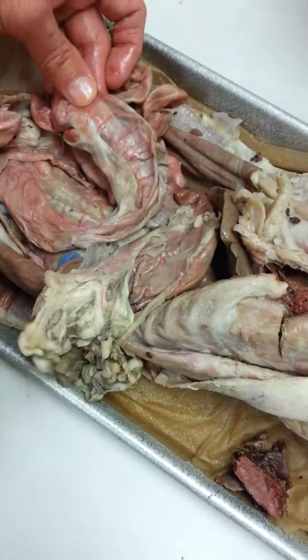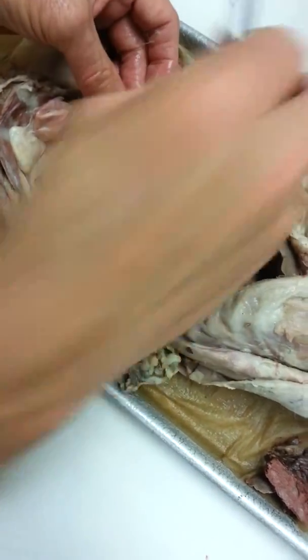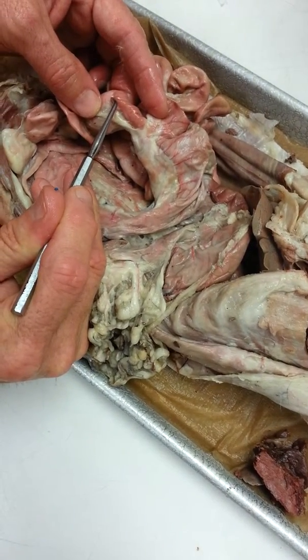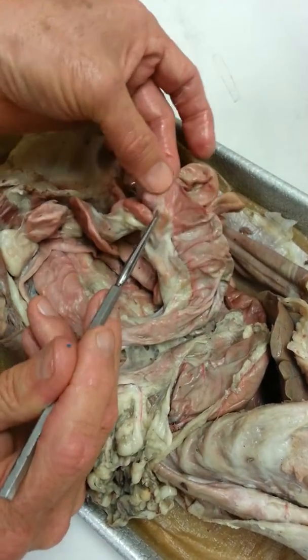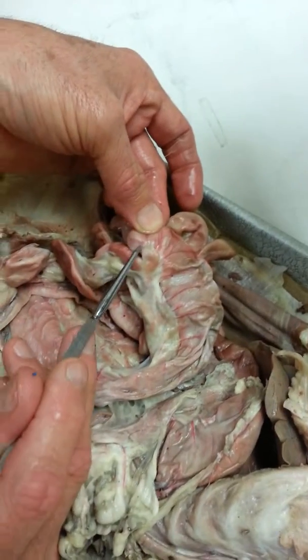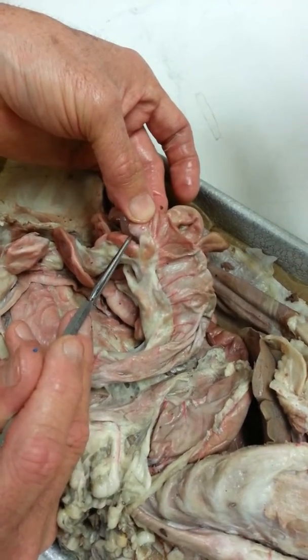Here's your colon right here. This whole structure is colon. So what I would do here, I'd put it like this. And if I said name the structure right here, this is going to be ileum of the small intestine. That's the last portion of the small intestine right here. That's ileum. If you see this little pouch right here, that's the cecum, and that designates the start of the colon or large intestine. It's a little blind pouch. Our appendix would be off of this right here, but the cat doesn't have an appendix, so there isn't one.